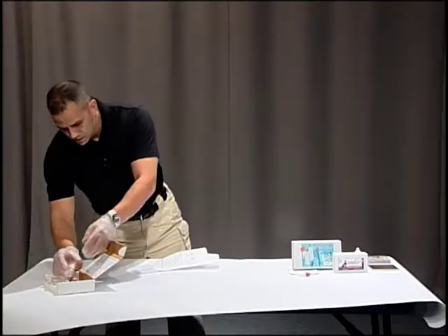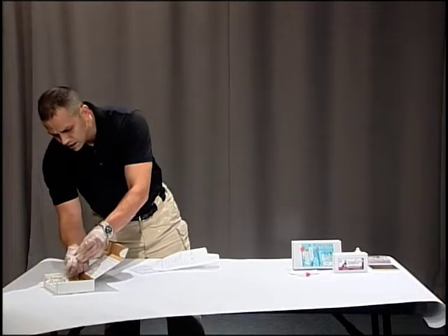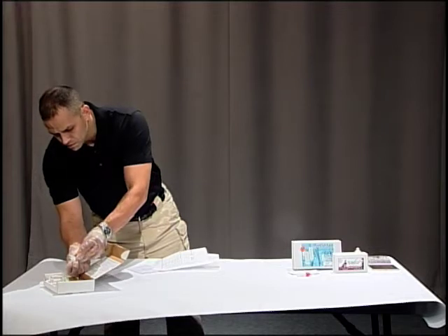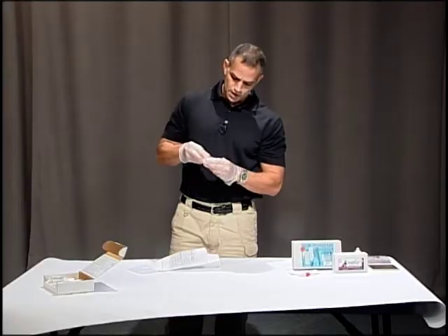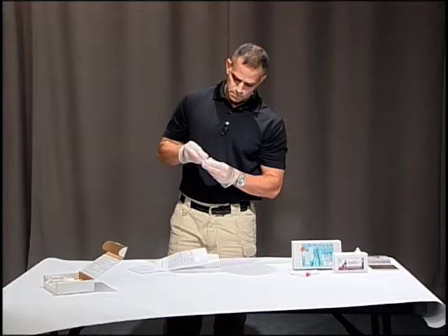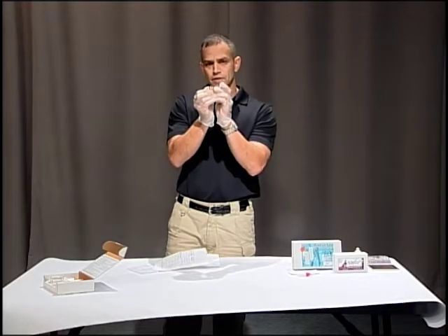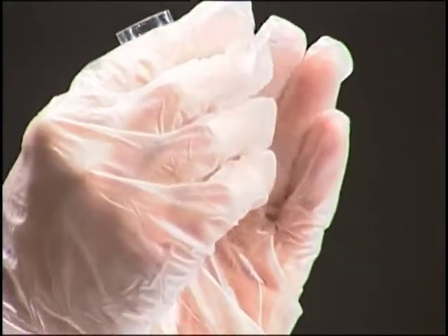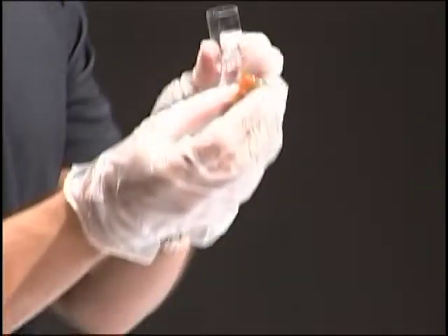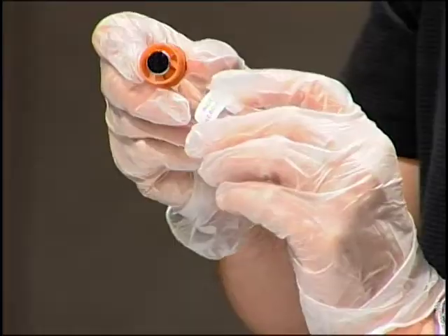Looking at these other swabs, they're going to tell you where you're going to swab. To open one, I remove the cap — you can see there's a little plunger on the end that's sticky. Normally I wouldn't touch that if this were out in the field. Then you're going to swab where it tells you to swab.